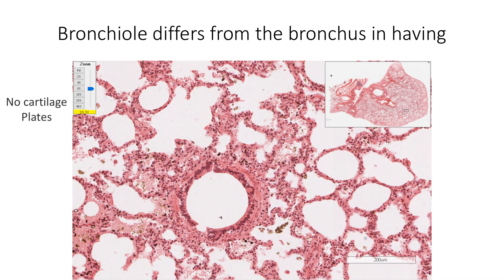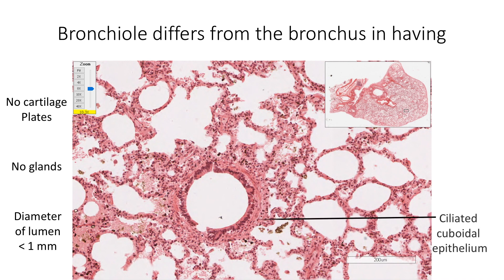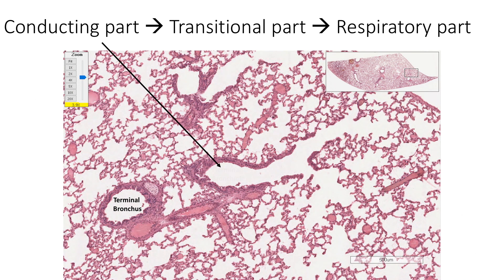Bronchioles differ from the bronchus in having no cartilage plates in their walls, no glands, and a lumen diameter of less than 1 mm. They are lined by ciliated cuboidal epithelium and have circumferential smooth muscle in their wall. Here we see a terminal bronchiole — forming the conducting part of the airway passage — dividing to form the transitional zone, that is, respiratory bronchioles with pockets of alveoli in their wall (shown by the arrow), which in turn branch to form the respiratory part: alveolar duct (marked as AD), atrium (marked as AT), and alveolar sacs (marked as AS) showing alveoli in their walls.